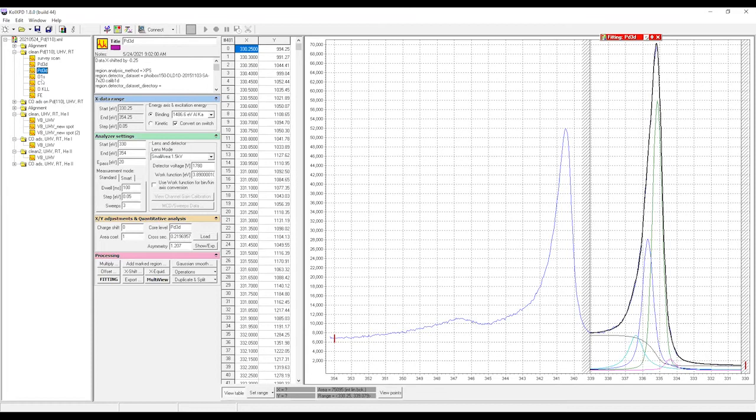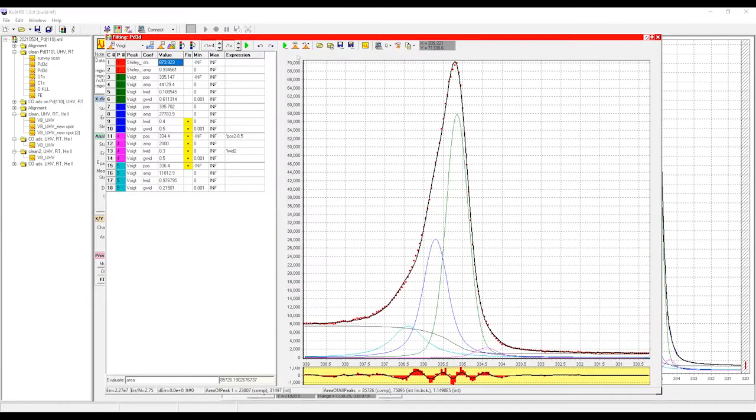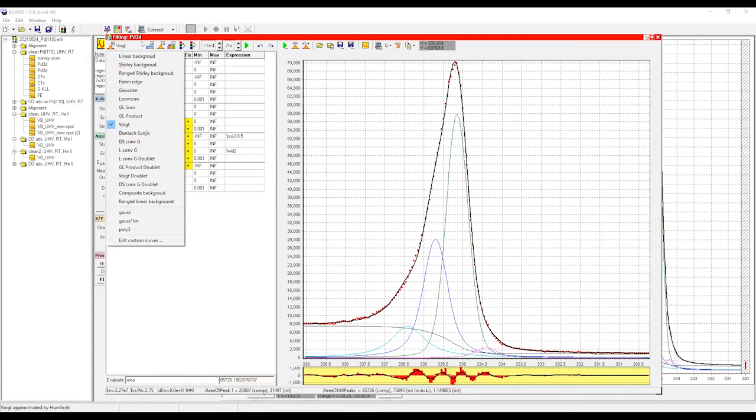For a couple of years we have been using software which was developed by our colleague, a former student of our faculty, our department, and our group. It's quite convenient, but the basic principle is the same for any other software you are using. There's always a couple of functions that can be used for fitting. Here you can even choose purely Gaussian or Lorentzian.